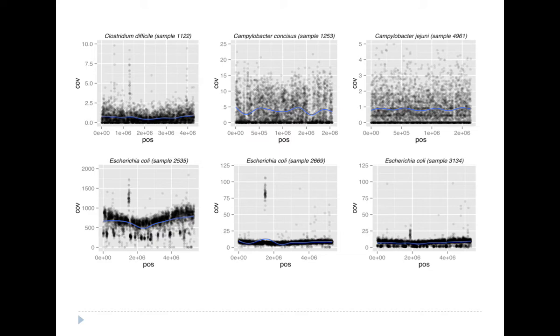Curiously though, the ratio of those phage-related sequences to the backbone changes in different samples, and we don't quite know why that is. In this sample over here, we see an interesting phenomenon in that as you're going along the coordinates of the STEC genome at the bottom, the outbreak strain genome, and you look upwards, you can see that there's actually 2 lines across there, if you like, as we're going across that alignment, with different depths of coverage.